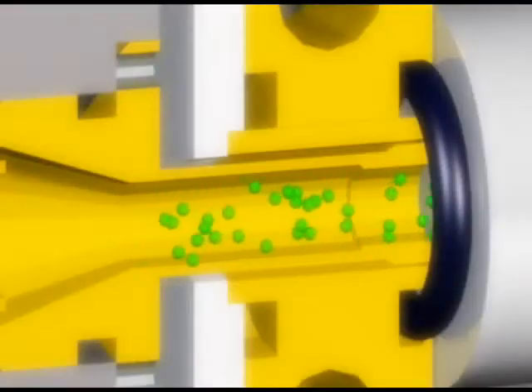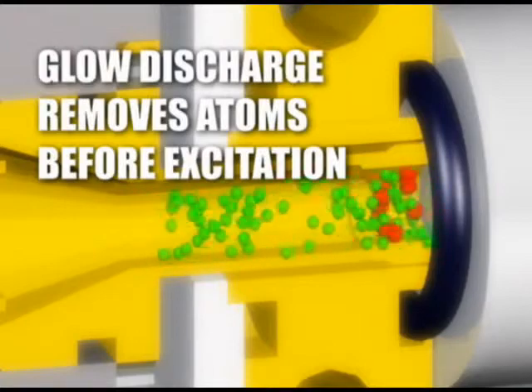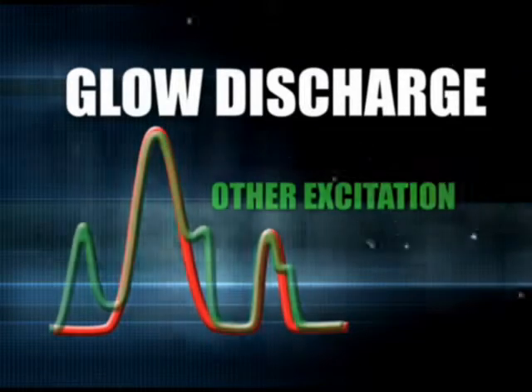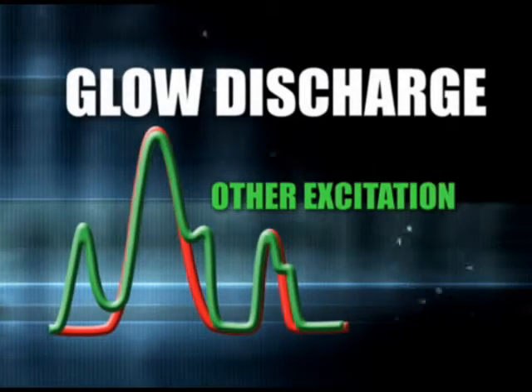Glow discharge emission is superior to other emission techniques because it allows the removal of atoms before the excitation process. This results in less complex spectra, exhibits fewer interferences, and provides excellent results.